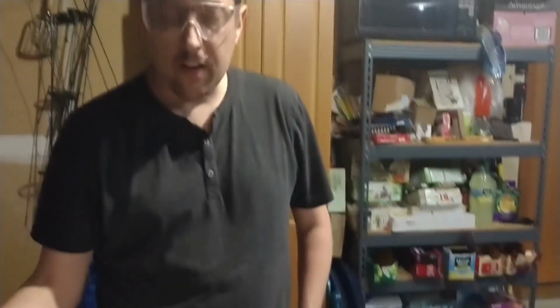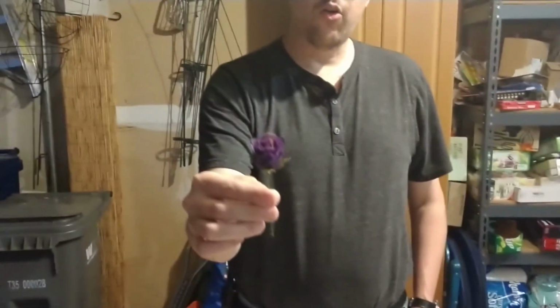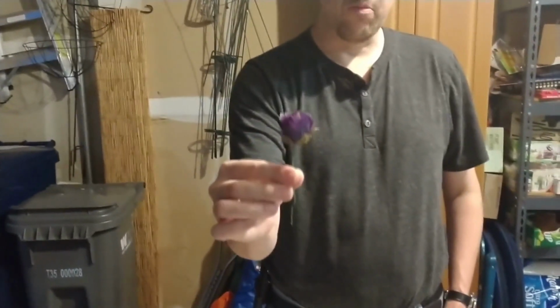What's going to start to happen is, as the acid reacts with the sodium bisulfite, it's going to start giving off sulfur dioxide gas. How do we know this is happening? Well, I have here a silk flower that has been soaked in an indicator solution, methylene blue.